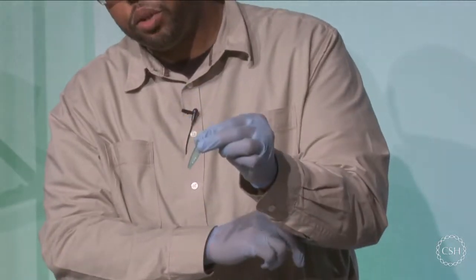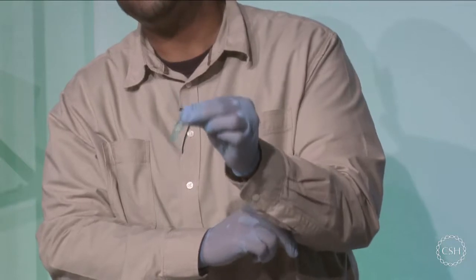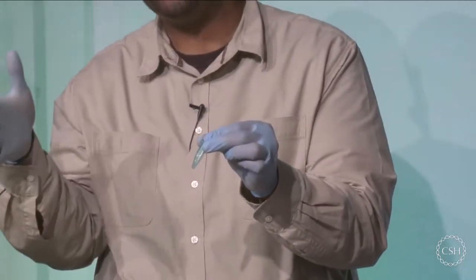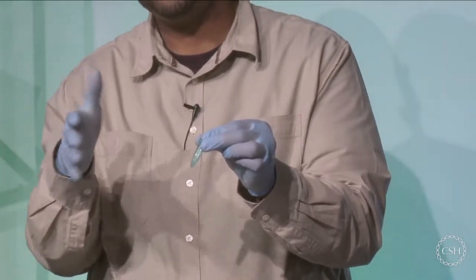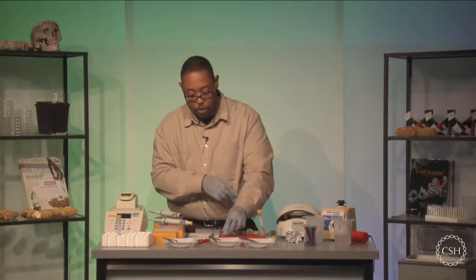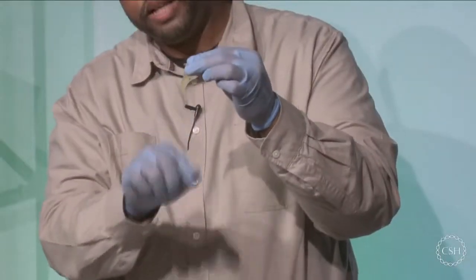And you can see that my solution now is a little cloudy. This is actually very important to show that you've mixed the silica resin very well. And this allows the silica resin to distribute throughout the entire supernatant and bind up as much DNA as physically possible. I'm going to move to doing this also for my other two samples. So I'm going to finger vortex this one.